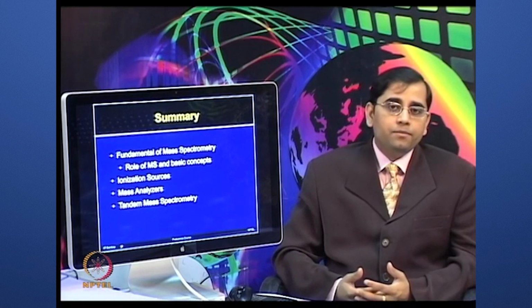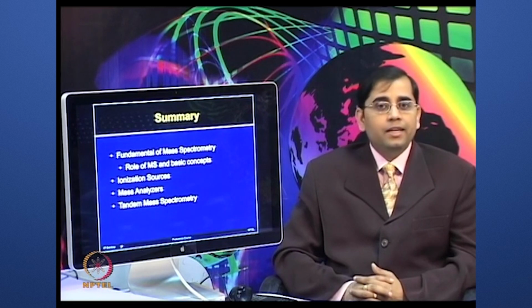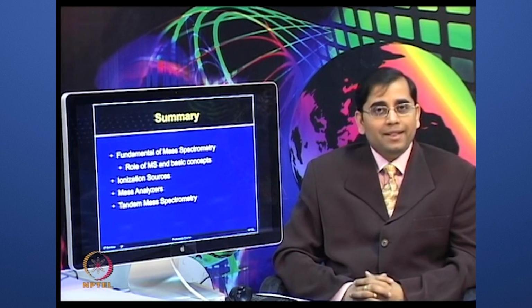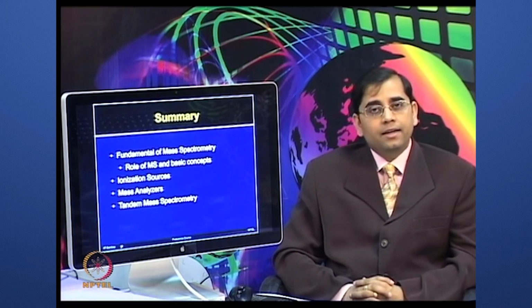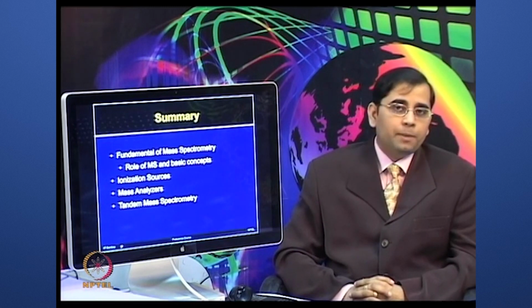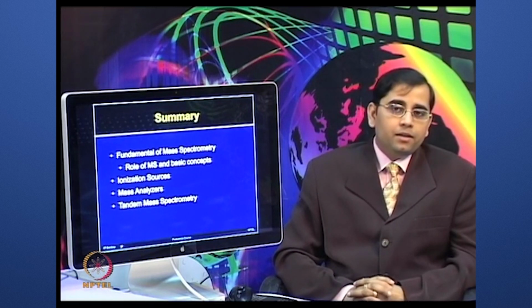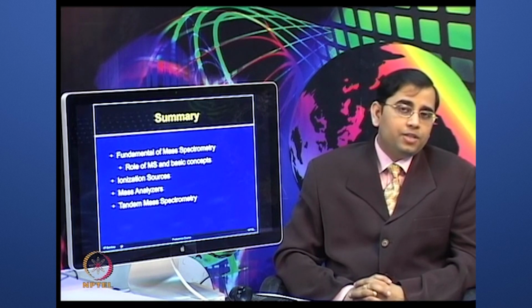It should possess wide mass range, high sensitivity, high resolution, high mass accuracy, true MS/MS and MRM capabilities, wide linear dynamic range, multiple charge separation capability, and polarity switching capability with rapid, complementary ionizations.